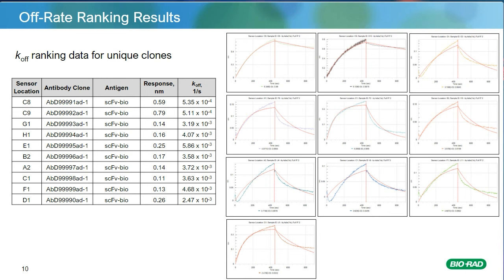It's important to note that this is not an affinity measurement because it's done using E. coli lysates of expressed Fabs. We are able to perform proper affinity measurements later on with purified antibodies, and this is required to generate the on rates, as we need to know the protein concentration. One other thing to mention is that these are antibodies in a monovalent format, and if you're interested in converting to a bivalent format, you may see avidity improvements because of this.